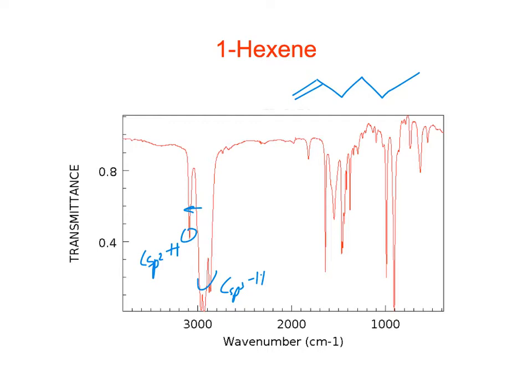Down in here, I think here and maybe here are carbon double bond stretches. And then you can just see this one is much more complicated down in the fingerprint region. Sometimes I've seen seminars where people were really interested in specific stretches, even carbon-hydrogen stretches, and so what they'd have to do is run one spectrum, make another molecule that has a deuterium instead of a hydrogen at that position, and then look for changes in the spectrum.